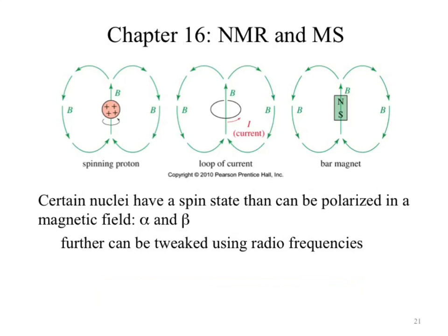Actually, before we do that, so we've got our tiny magnets that we drop into a big magnet. What things could we potentially do? Well, we have to now tweak it somehow. That tweaking process is using radio frequencies.